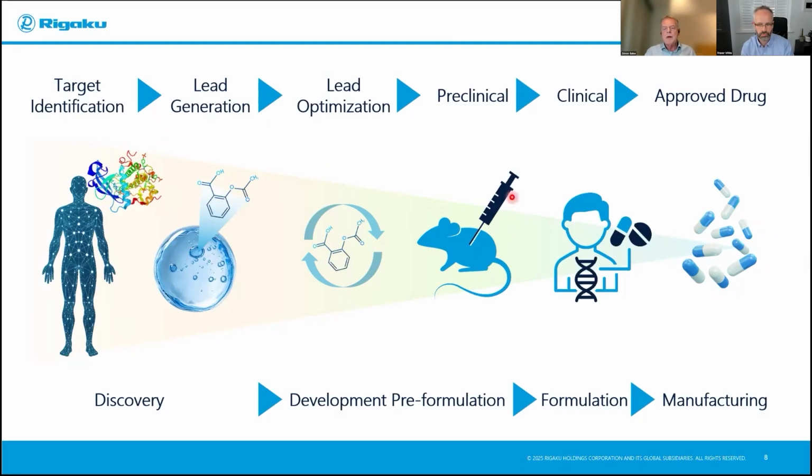So what I'd like to do is step through each of these regions one at a time, and let's see where electron diffraction can be applied.